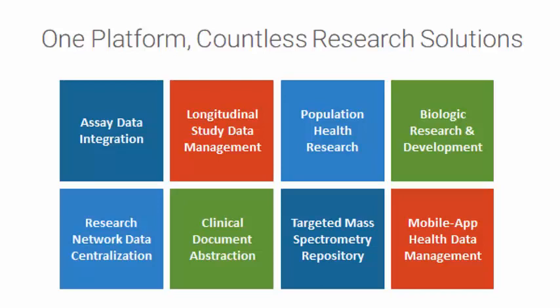These activities are all logged and can be reviewed later by an administrator. The compliance features also include de-identifying data so that we're able to mask or randomize patient IDs, names, etc. So that's just a quick overview of some of the key features that are relevant here inside of LabKey Server.